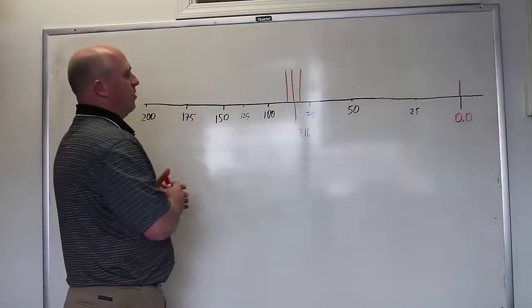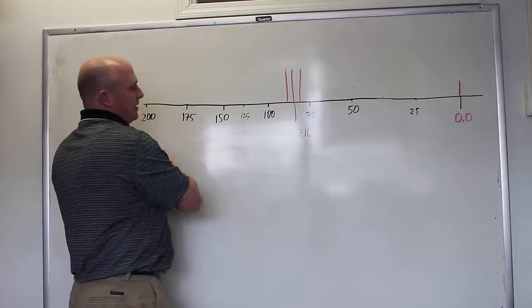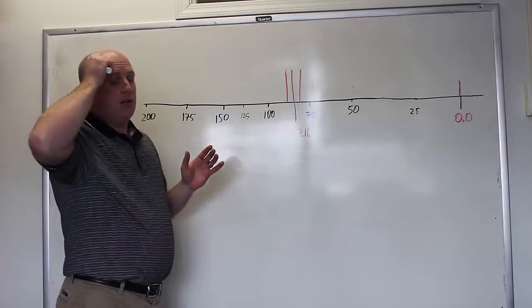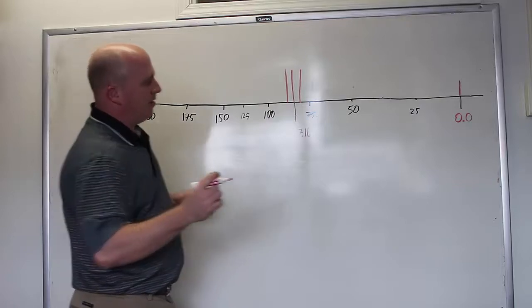Chemical shift in C13 NMR. You're interested in the x-axis. Where peaks show up along this x-axis tells you what the carbons you're interested in are bound to. There are two magic numbers in carbon NMR.